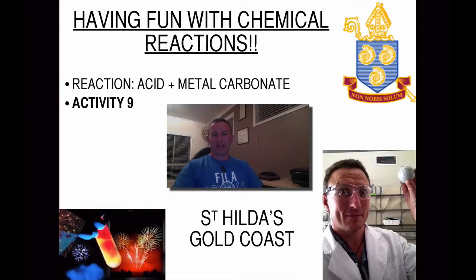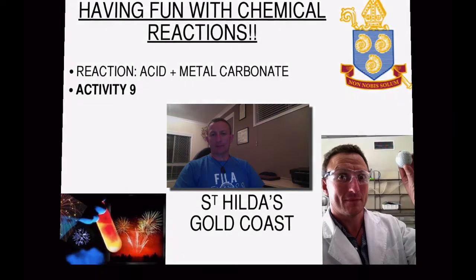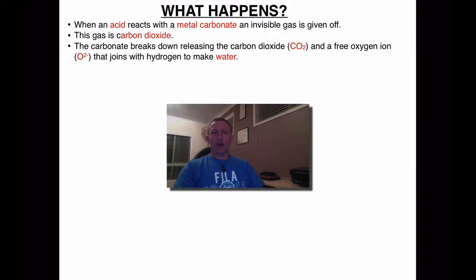Fun with chemical reactions. In this reaction, we're going to look at what happens when we react an acid with a metal carbonate. Okay, now when we react an acid with a metal carbonate, we find that a gas is given off. Now this gas is carbon dioxide.